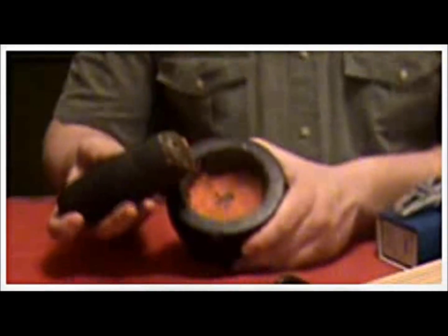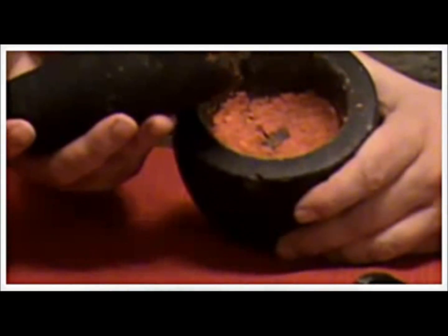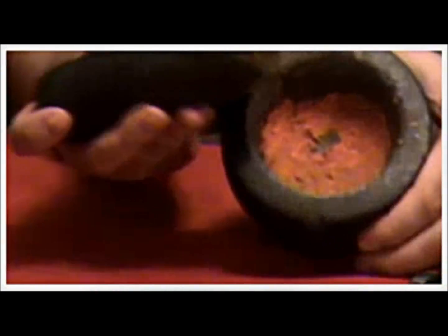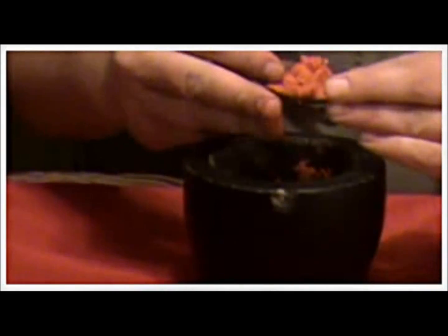Okay, there we have it. We have pounded this up into a fine pulp. By doing that we've ruptured all the cells in the carrot. Once we have it, we scoop this up, put a little bit of this on the mesh, and take it over to the refractometer.